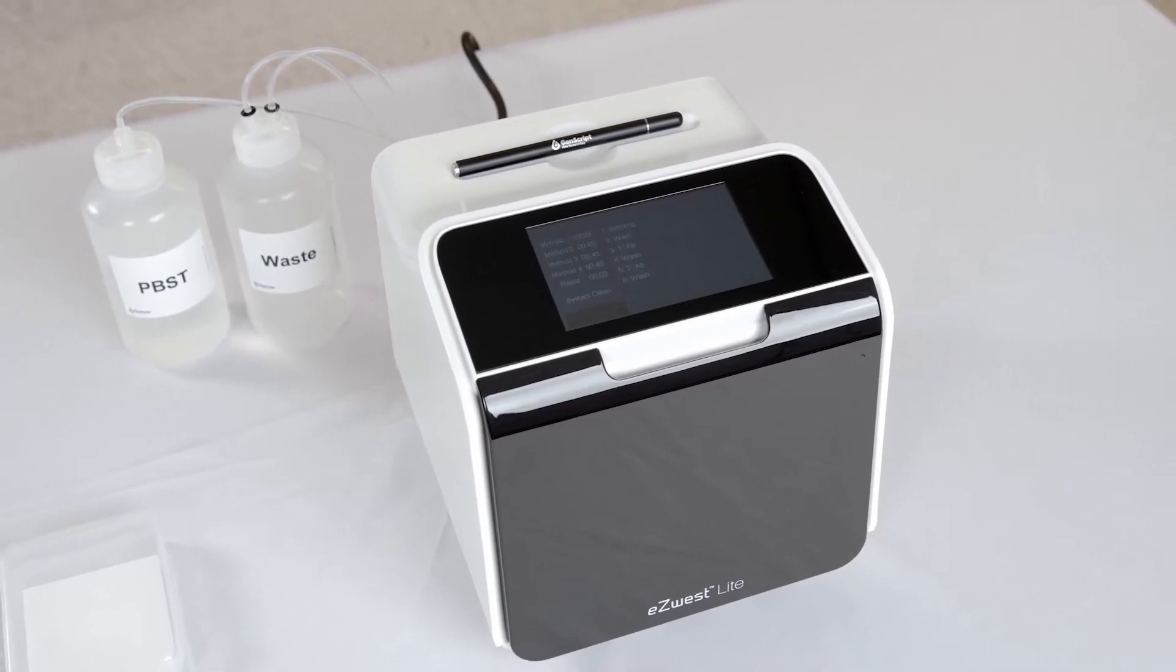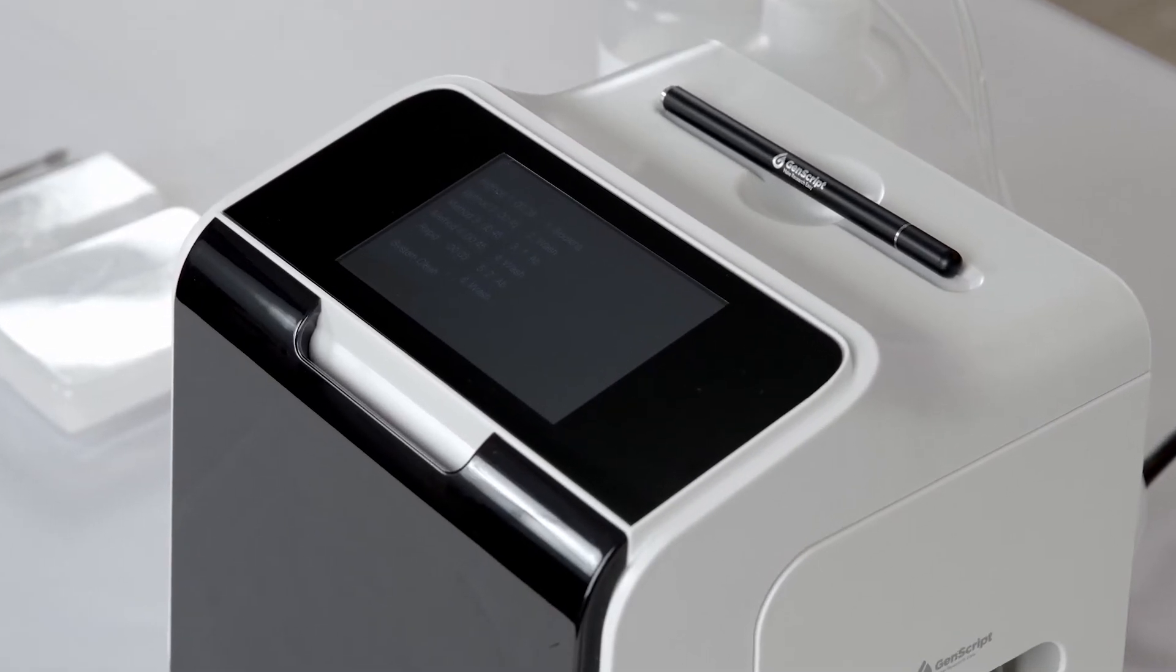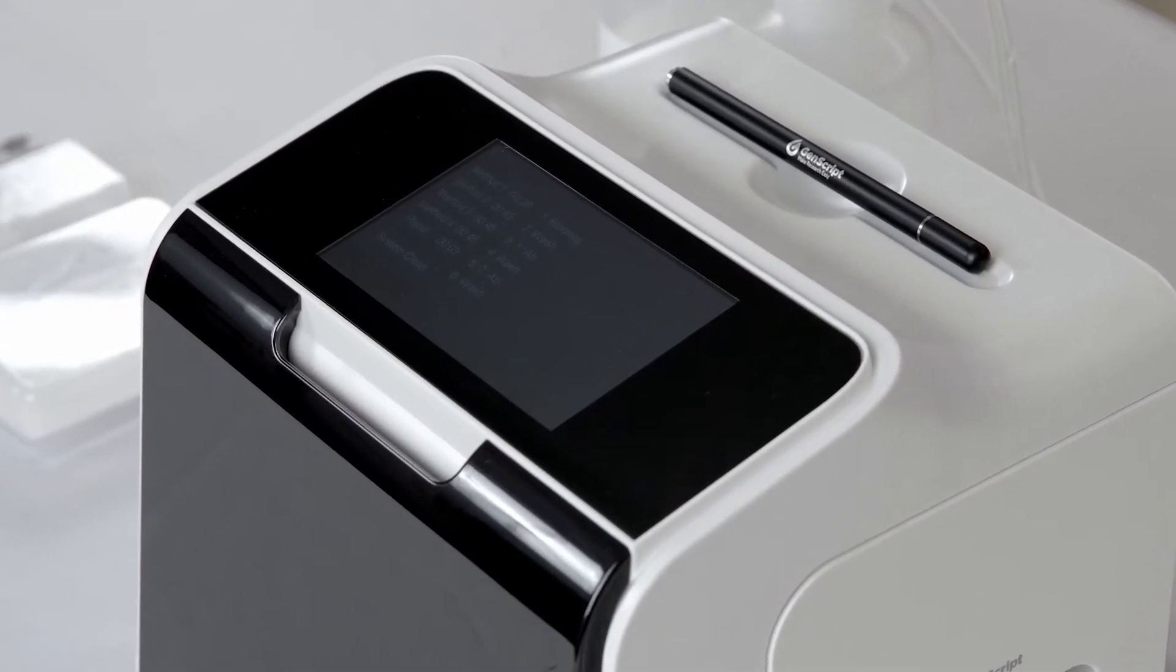With many advantages including automatic antibody recovery and a customizable program, EZ-West delivers consistent results.